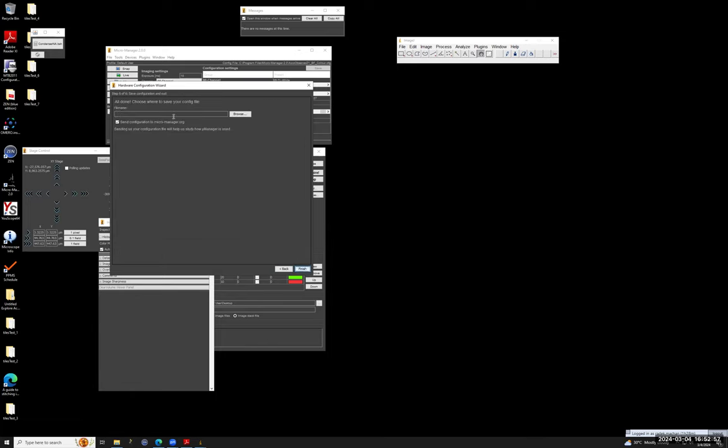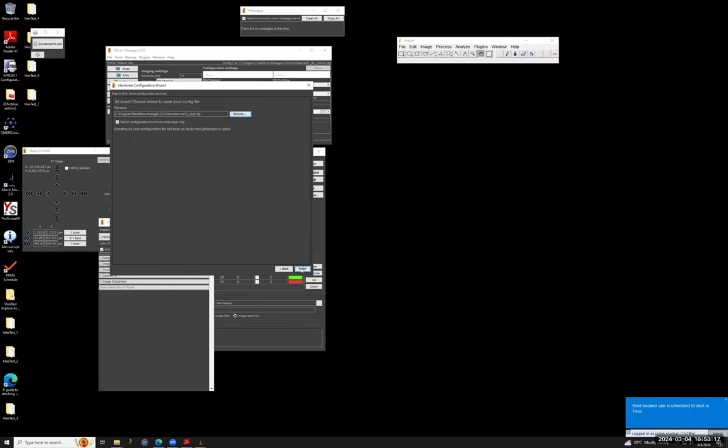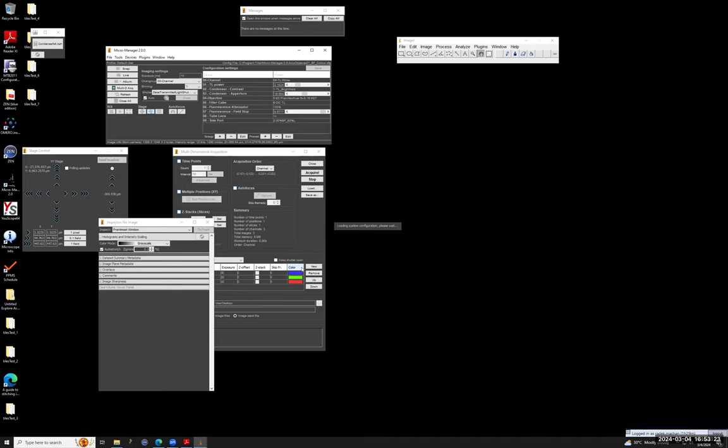And now then I can save it under a name. Let's call it test. Then here for configuration, set on S. When I finish, it will load the new configuration, which, remember, I had here all these controls and they are gone because they were part of the configuration. So I will have to add them.